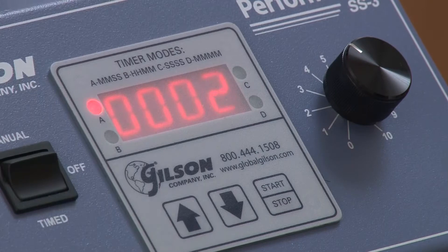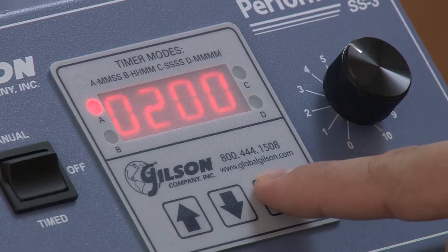And for convenience, once the cycle is completed, the timer will automatically reset to the desired test time.